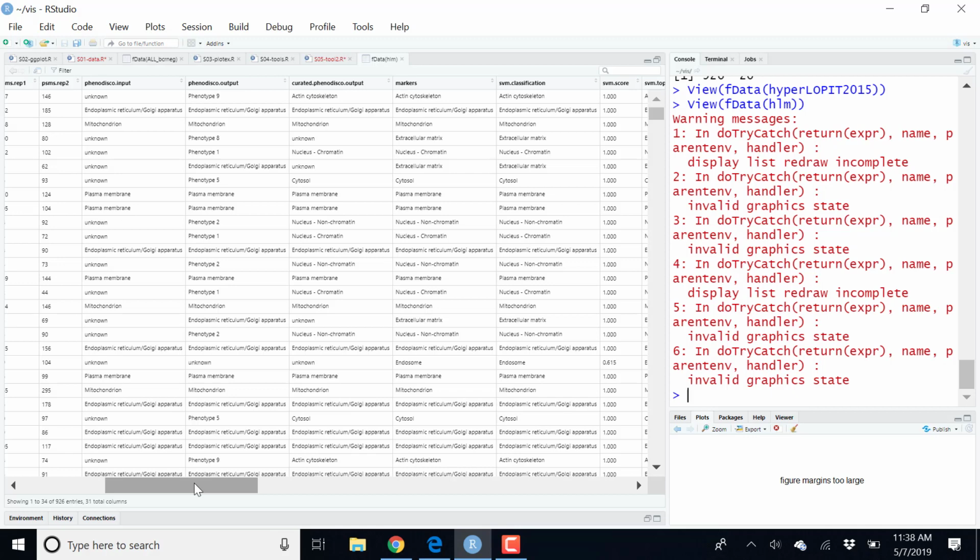Okay. So the idea is now to do some hierarchical clustering, not on the columns, not on the samples, but on the rows. The code is exactly the same, we need to calculate distances and hierarchical clustering.